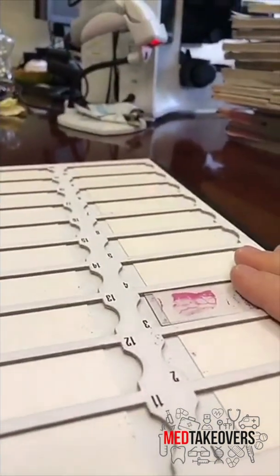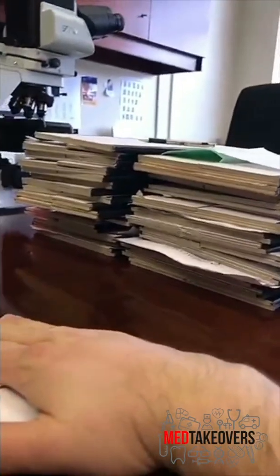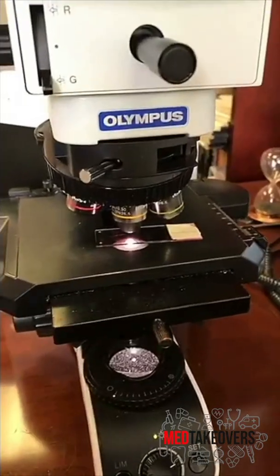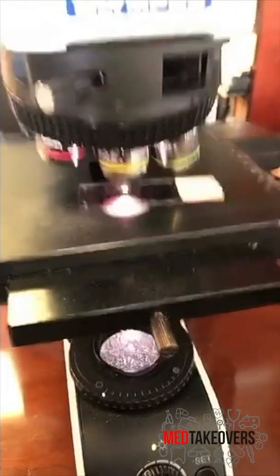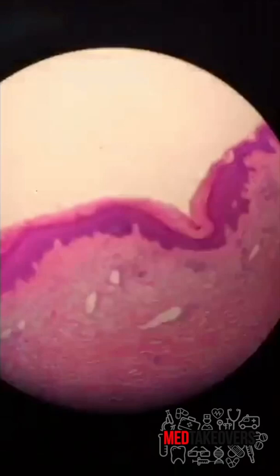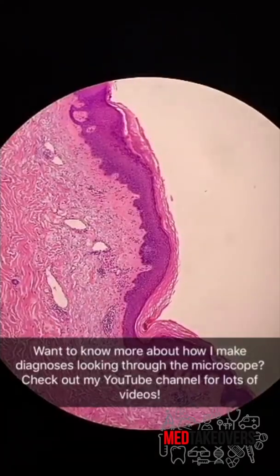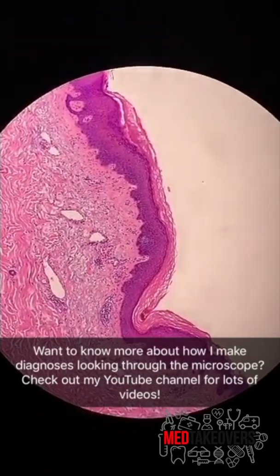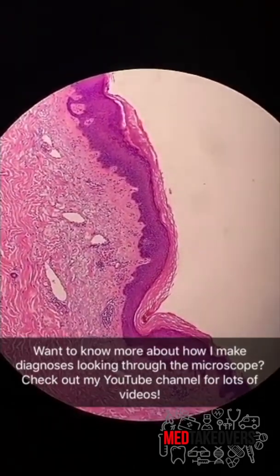So now the slides come out on these trays and I'm ready to read them. As you can see, I've got a pretty big stack of work to do, so I better get to it. Here's the glass slide on my microscope stage, and here's the look if we can get it through the eyepiece. It turns out it's kind of hard to do that without focusing first, but here's looking through my iPhone down the ocular at the skin on the microscope.